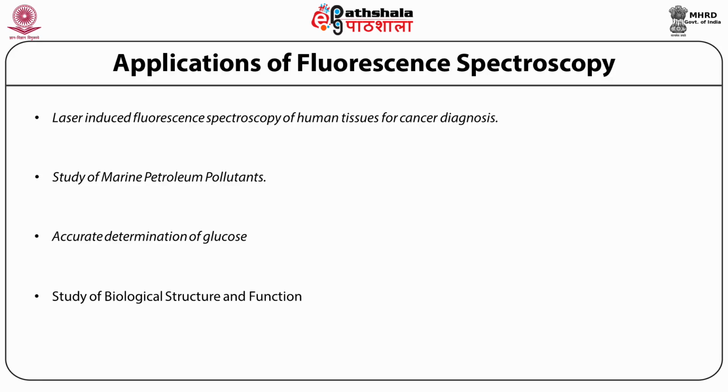Fluorescence spectral changes resulting from the solvent relaxation of fluorescent amino acids such as tryptophan and tyrosine are important reporters of protein structure and folding.